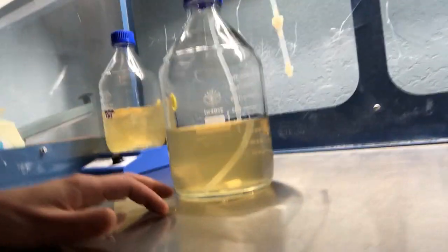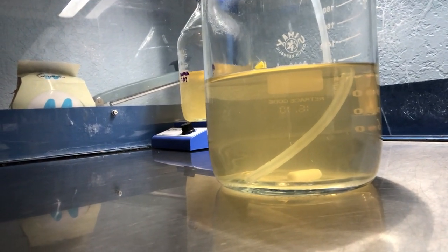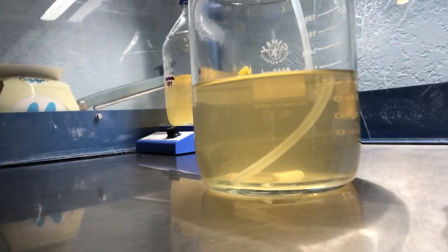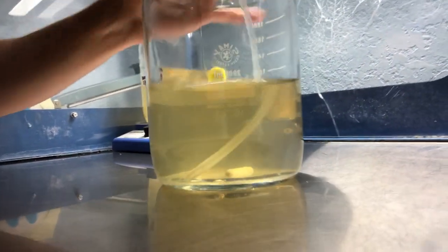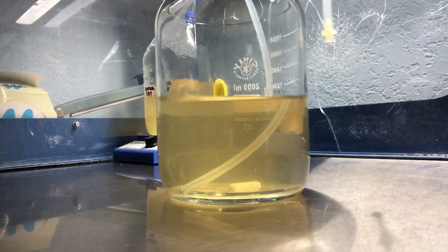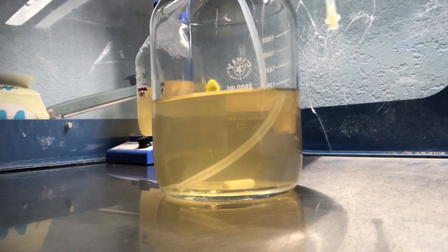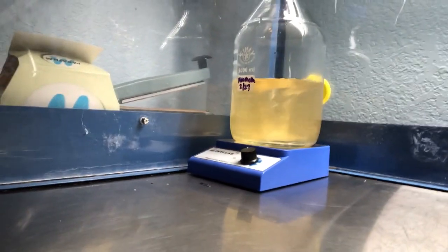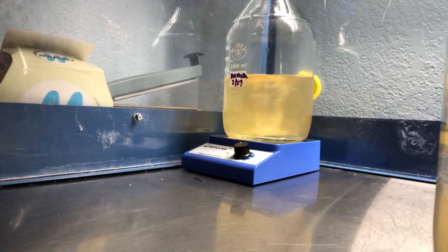Alright guys, so it's been about 90 hours or so, and I'll zoom in on this liquid culture. You can see how clear it is right now. If there's any kind of bacteria or yeast, it would be very cloudy. You can see that the liquid is still transparent. So I'm going to go ahead and add the cordyceps slant culture to my liquid culture. And you can see behind there the Morchella that's been mixing for a couple days. It's starting to get quite thick, so I'm pretty excited for that.